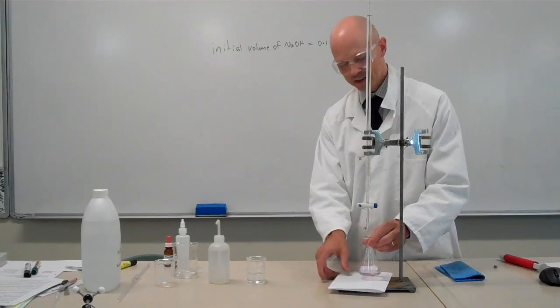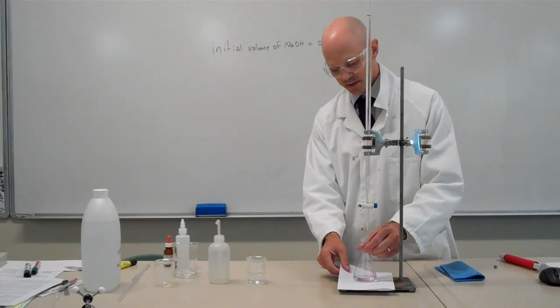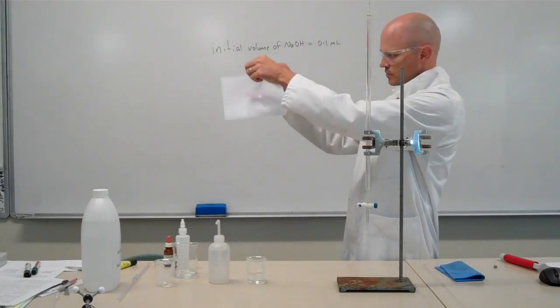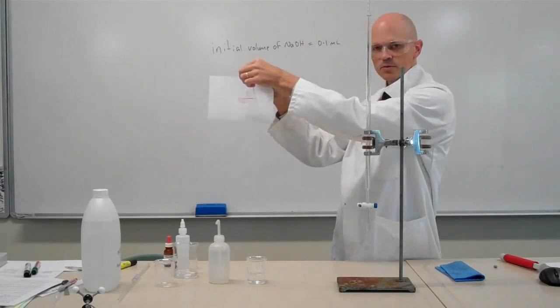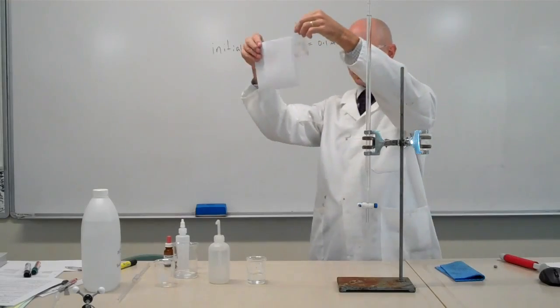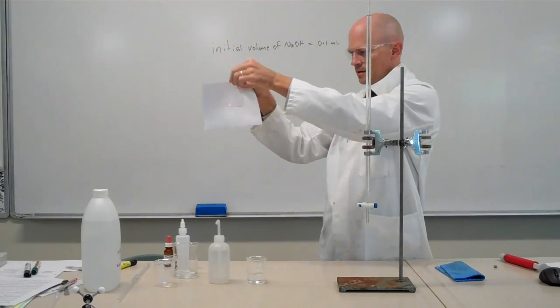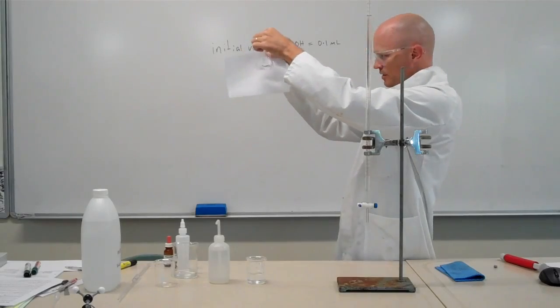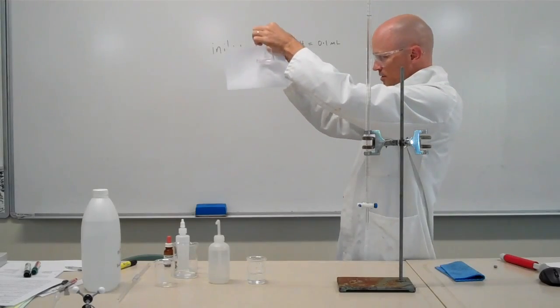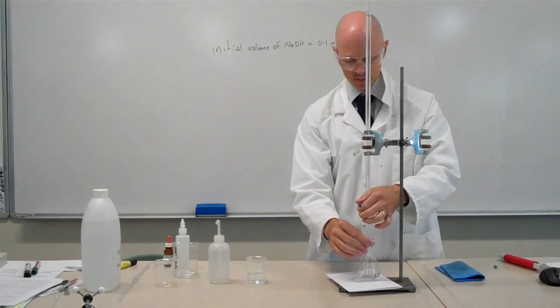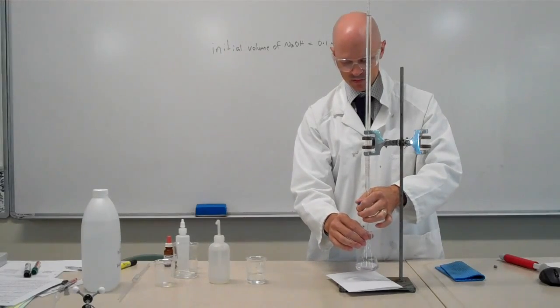Now I have a piece of white paper underneath the burette, which actually helps me see the colour change. Sometimes it can be useful to look through the actual liquid directly through. You can see the colour change a little bit better. I'm not sure if you can see on the video, I do have a permanent colour change there, very slight one. I'm going to add just a little bit more colour just so that it is a bit more visible.